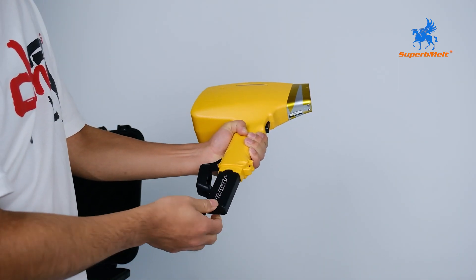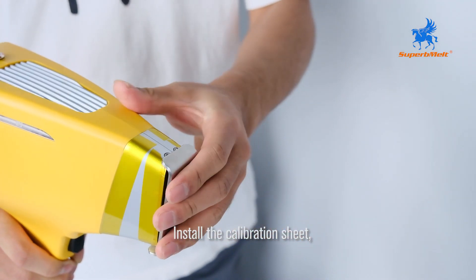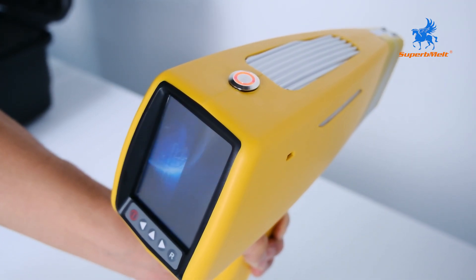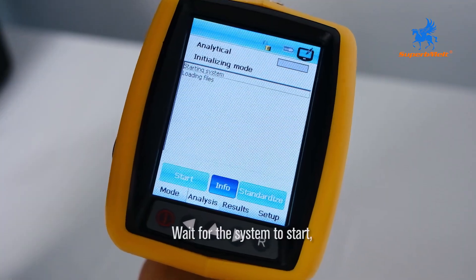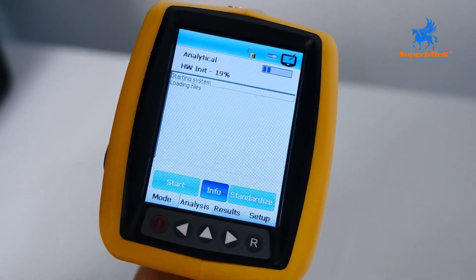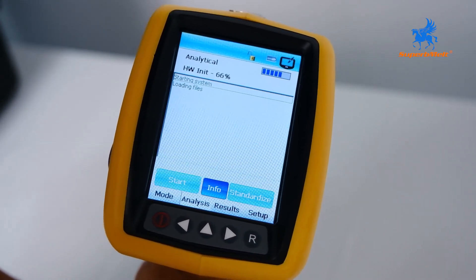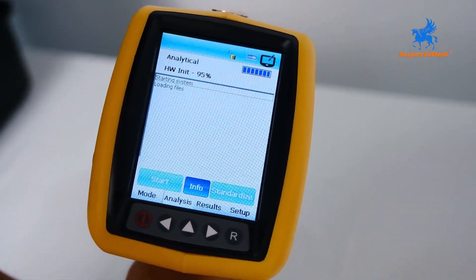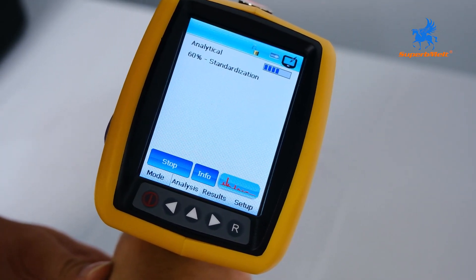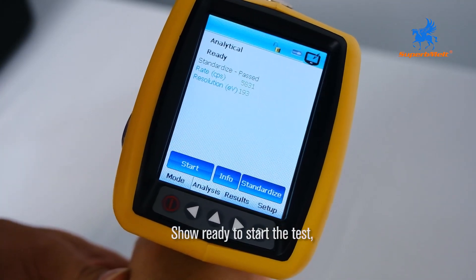Install the battery before use. Install the calibration sheet, then press the power button. Wait for the system to start and for the system to be standardized. It will show ready to start the test.